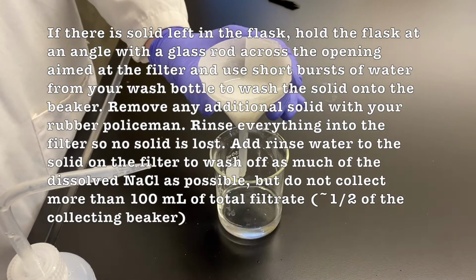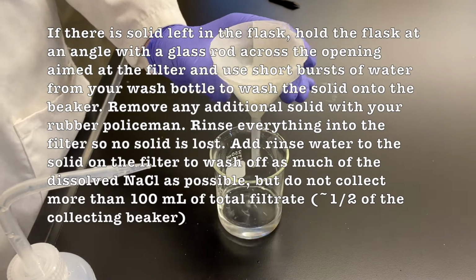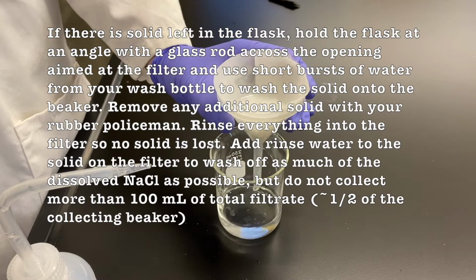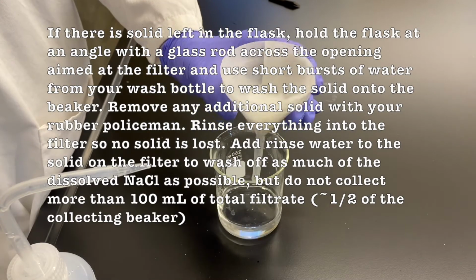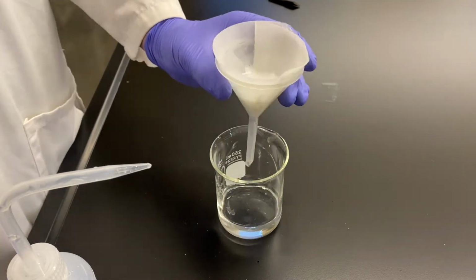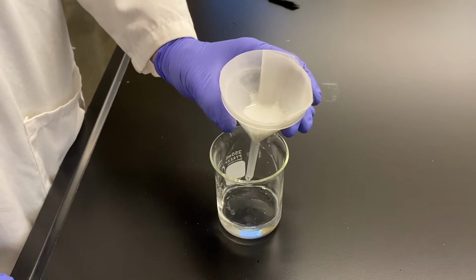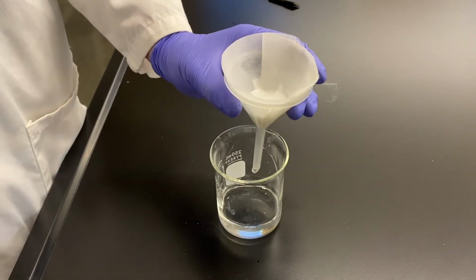And then we're also going to rinse it off with some water at the very end just to make sure all of our salt goes into our beaker. So now that beaker that we previously weighed, that you should have noted the mass, just has water and salt. So if we find some way to remove the water and keep the salt, we could get the mass of just the salt. Easy enough.